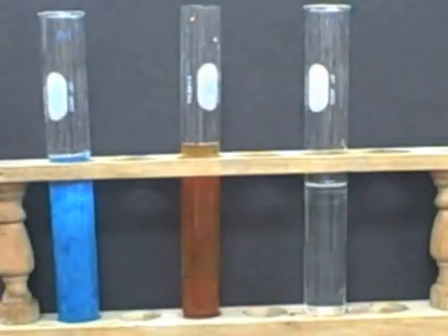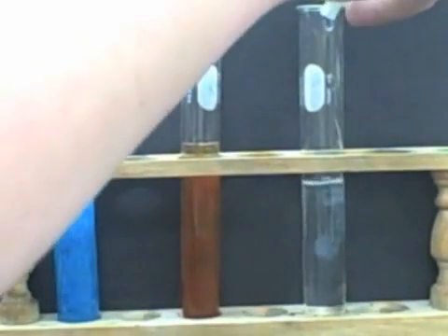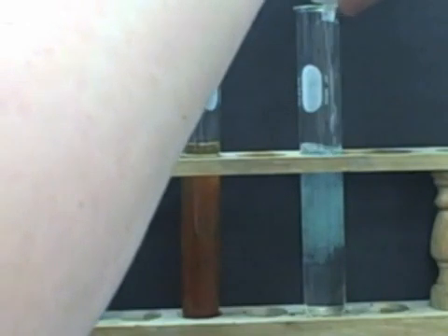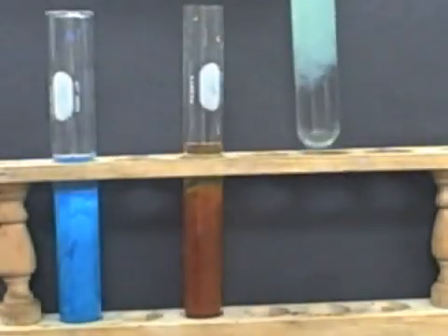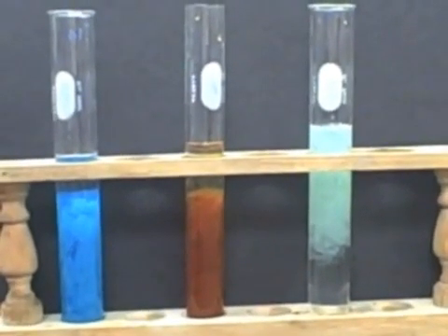And now this one is nickel. Nickel chloride being added to sodium hydroxide. Wow. That's green actually, that's a light green color. That's nickel hydroxide. Wow, that's a great color. It's almost the same as the nickel chloride actually. Here's the precipitate there, and you can see it's kind of floating. So those are transition metal hydroxides, and now we're going to do carbonates.